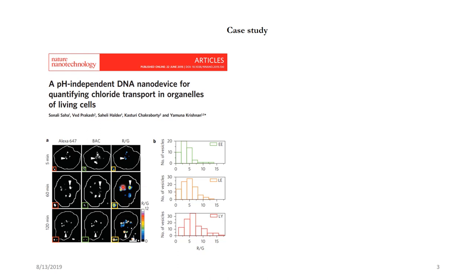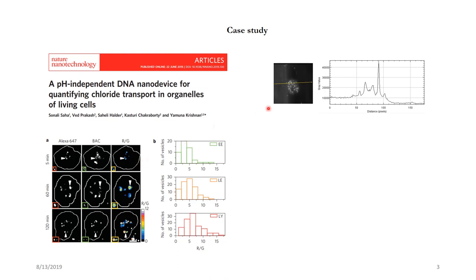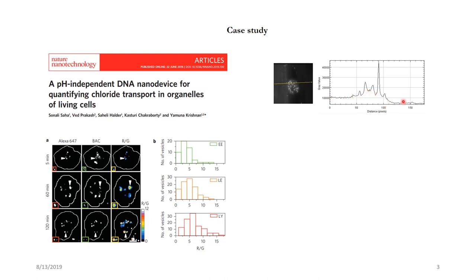If an image is very clean and nice like this then the analysis is very simple. But unfortunately living systems are not that simple and as you can see here is an image, it's a coelomocyte or a single cell where there are individual endosomes which are labelled with the device. And if you try to draw a line profile here what you will see is that the intensities are not homogeneous. The background here is more compared to background here and the image also is noisy.